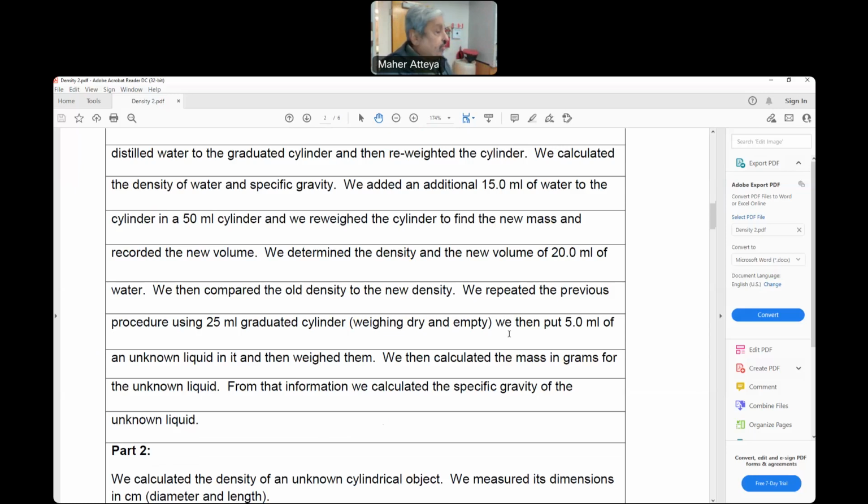And then we measured the watch glass and the beaker using two different balances. The top-load one does not give us very precise values, just 4 sig figs, and the other one gives 6 sig figs, which is more precise and gives us even better precision and better accuracy, both.